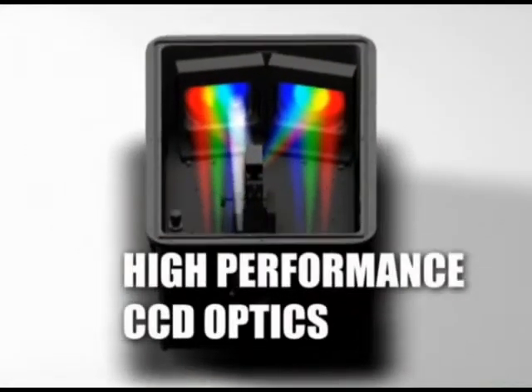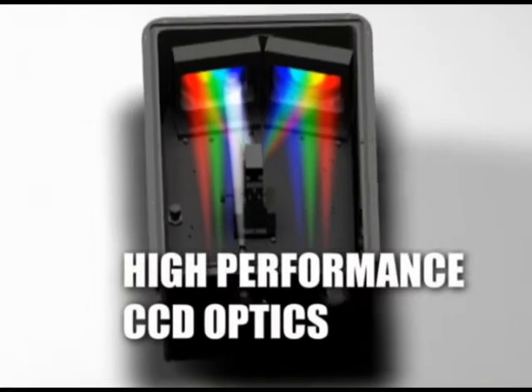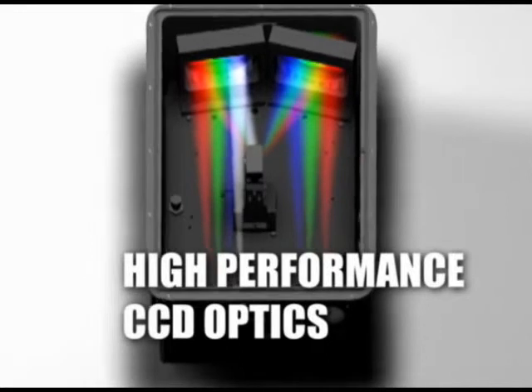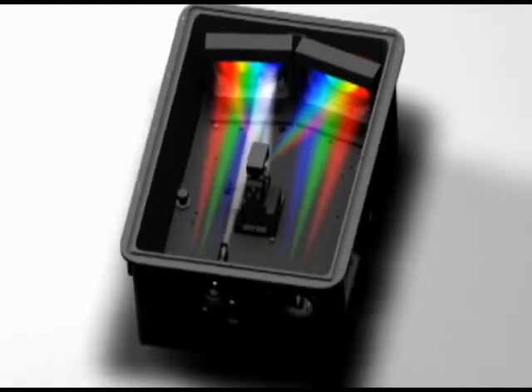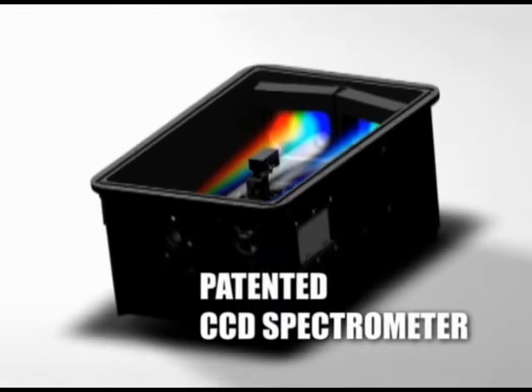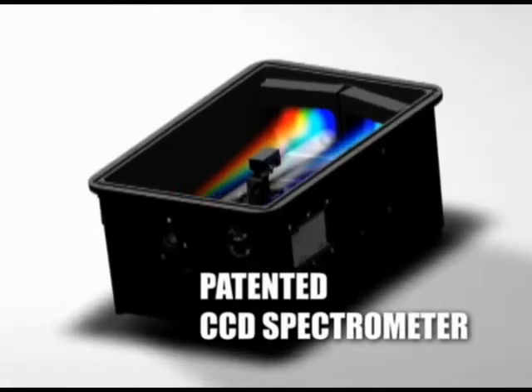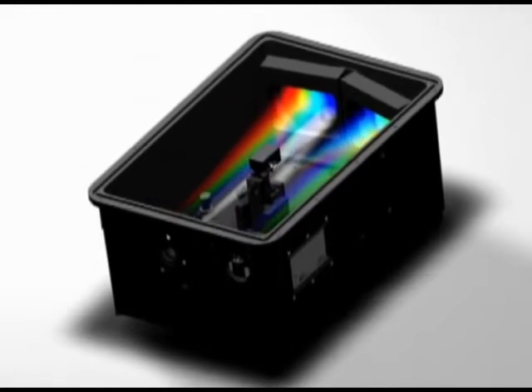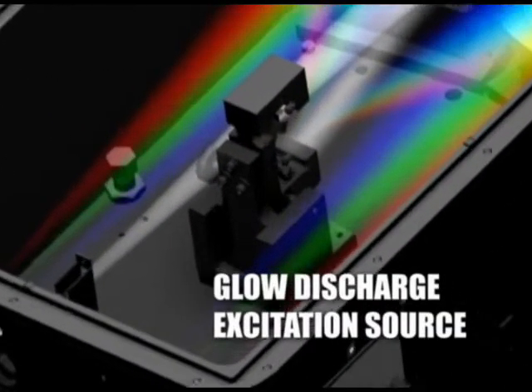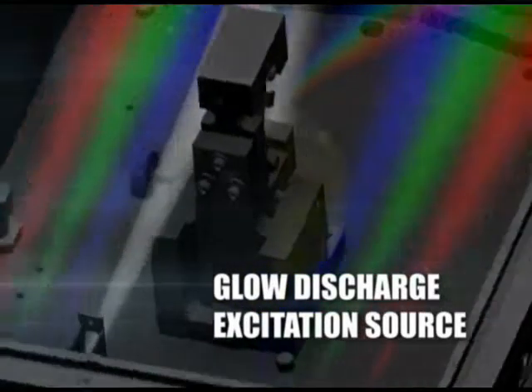Advancements in glow discharge technology and a new CCD spectrometer design have led the way in the development of the GDS500 glow discharge spectrometer. The GDS500 is designed for routine analysis and uses a patented CCD spectrometer coupled to a glow discharge source. The Leco GDS500 brings to the laboratory the controlled, uniform excitation needed for the analysis of your materials.